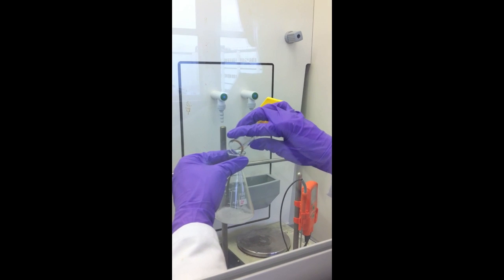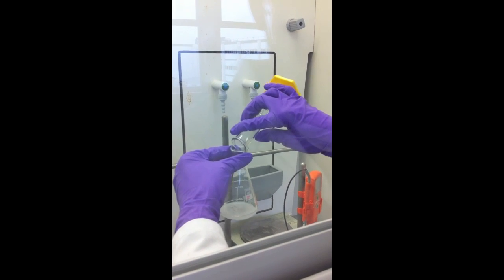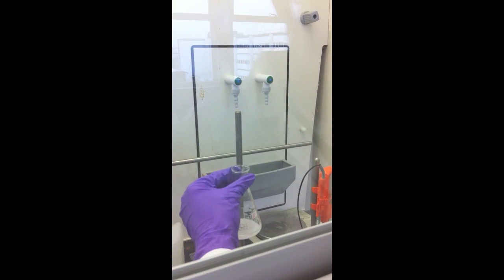The reactant was dissolved in methanol. It dissolves in methanol because the functional group is polar, and methanol is also polar.